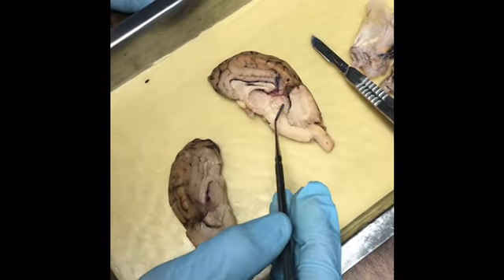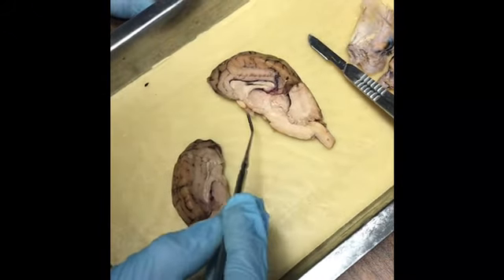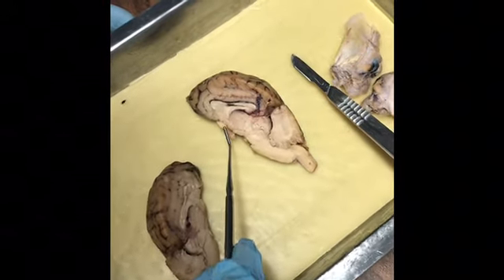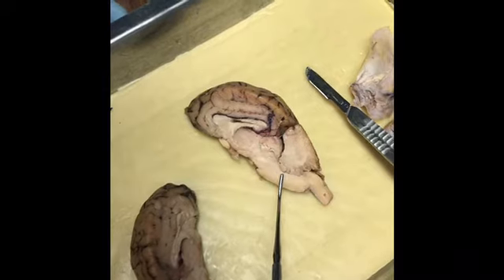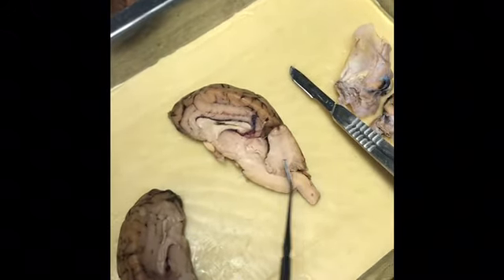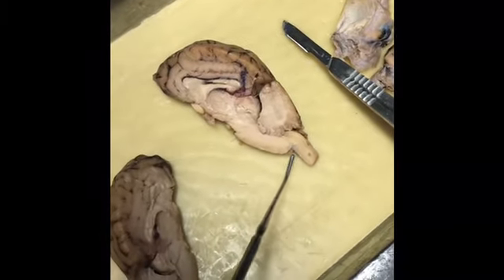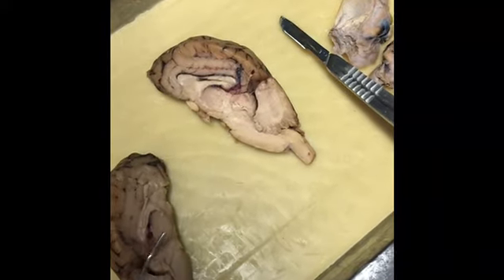and the spinal cord. I'm going to go ahead and explain the parts right there, and the lighter parts would be the white matter, and then the darker parts would be gray matter. And then the dorsal and ventral roots would be what would be located in the spinal cord if they were visible.